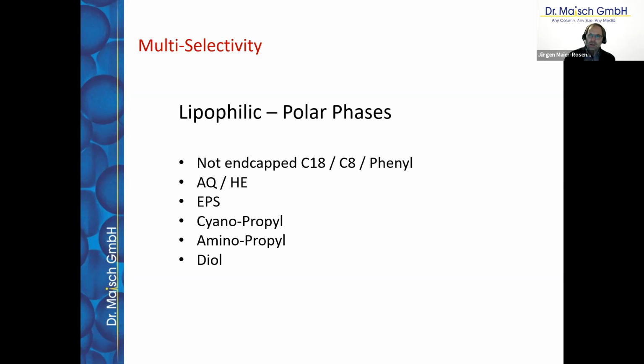possibility. One of the most sold and most used columns with a lipophilic polar balance is the AQ, the aqueous phases, or HE for hydrophilic end capping. And there, beside the C18 groups, we have a polar group on the surface, which offers the polar interaction for polar molecules.